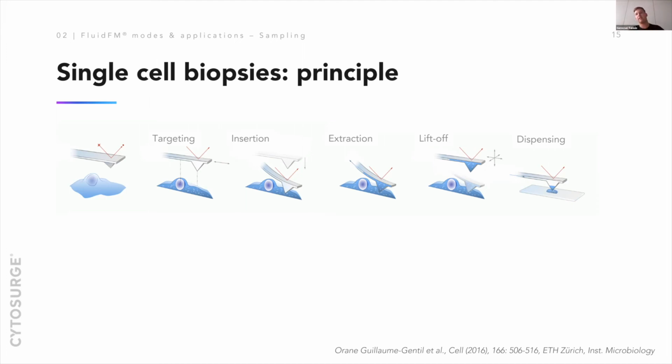So in this way, we can make sure that the valuable things that we're looking for in the extract are not going to diffuse away in the channel, since this mineral oil is really closing the volume that this solution can take up.